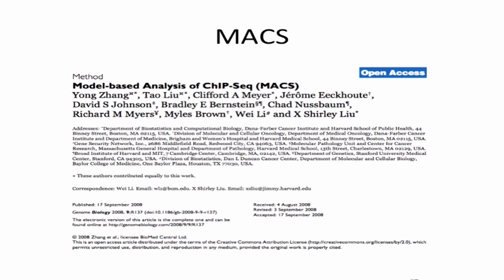So let's talk about ChIP-seq peak calling. There are multiple tools to call peaks from ChIP-seq data. This is probably one of the first ChIP-seq peak callers that was created. It's a pretty good tool that a lot of people use. It's not to say that it's perfect, but it's used by a lot of people. It's based on this idea. The idea is reasonably simple.